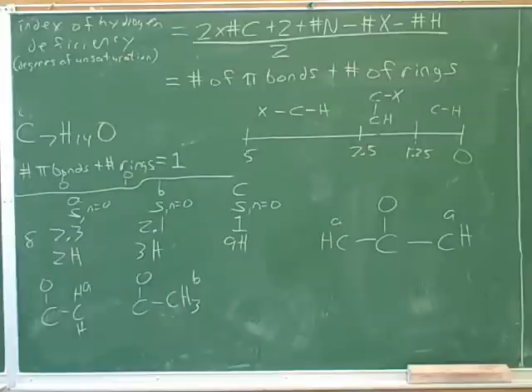For example, notice that here we have hydrogens on a carbon that's connected to a halogen. Well, all of those are in the 2.5 to 5 region. And here we have a hydrogen that's on a carbon that's connected to an oxygen. Well, that's also in the 2.5 to 5 region. On the other hand, here we have hydrogens where the oxygen is on the adjacent carbon. Well, that's in the 1.25 to 2.5 region, as we were predicting up there. And then if there's no electronegative elements around, it's to the right of 1.25, generally speaking. Although, I see here that this tertiary is actually between 1.4 and 1.7.